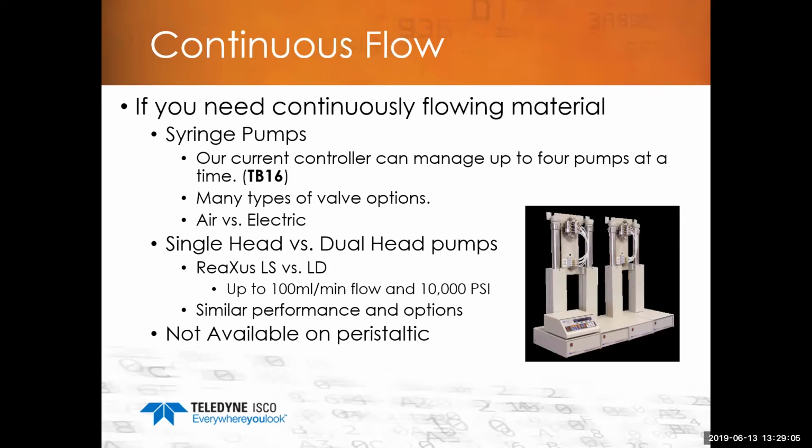But also the piston pumps have single head or dual head options. You could kind of daisy chain two single heads together or get one dual headed pump in the box. If you look at the Reaxis LD, that's a dual headed pump. And it gives you a continuous flow, and you can synchronize them to be at the same or alternating pulsations that allows the fluid to keep continually moving. You really don't have a continuous flow option when it comes to peristaltic unless you kind of daisy chain a few together, which might not be the most efficient. You may be better off doing that with a Reaxis, the dual-headed piston pump.